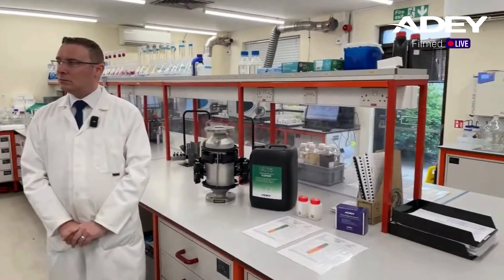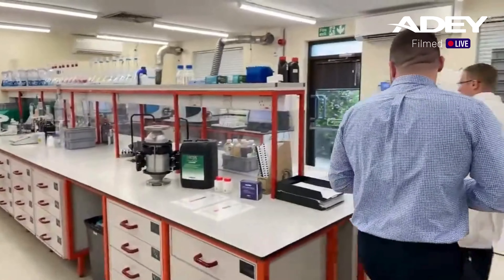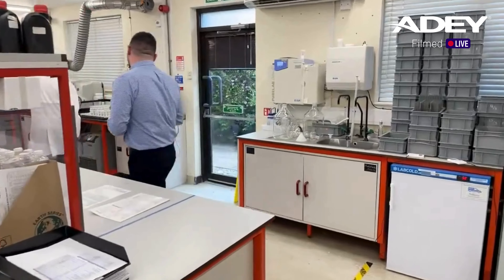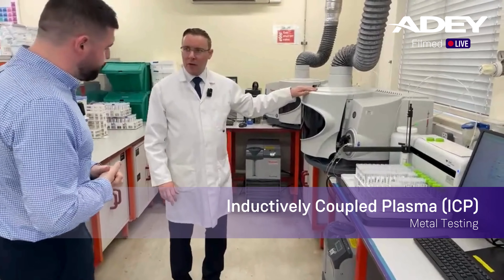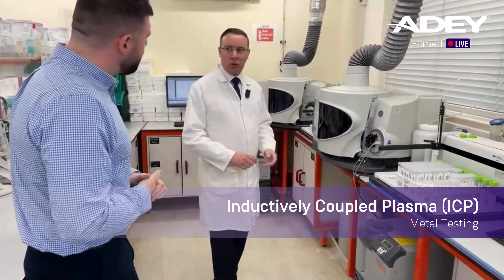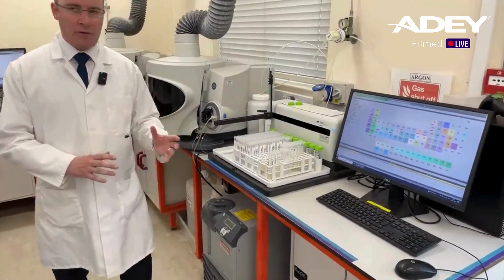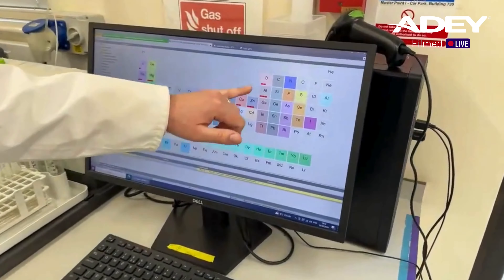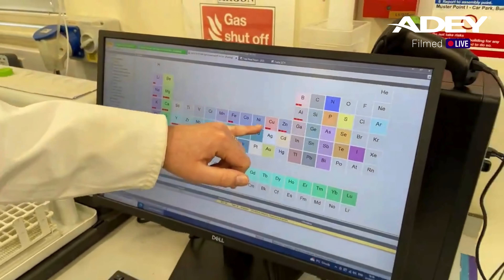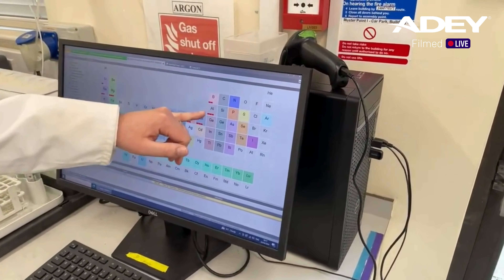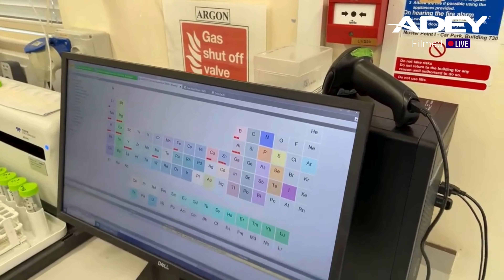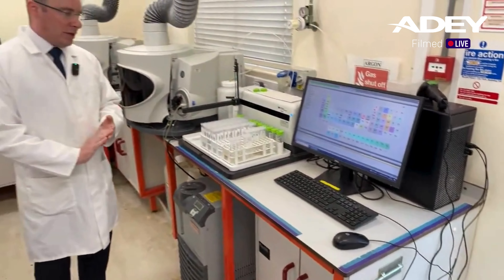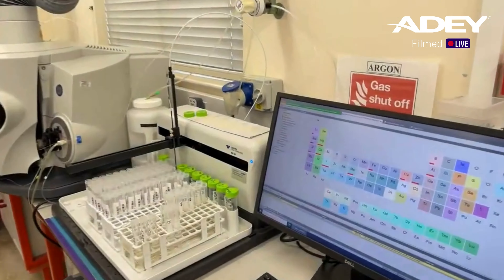Let's have a little look at the metallics testing - because this looks like some pretty advanced kit to me. So this is what's called an ICP, which stands for inductively coupled plasma, and this is the optical emission type. What it is doing here is we're looking for the metal components. We could analyse for most of the periodic table, but we've currently got it set up for the elements of interest: iron for radiators, copper for pipework, zinc because you can alloy to make brass, aluminium for heat exchanging material or radiators. Some people still use borax and molybdate as a key component of corrosion inhibitors. The samples are being aspirated up - this is actually working away right now on live samples.